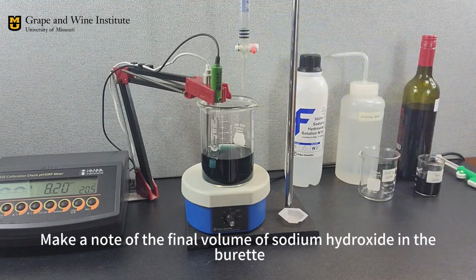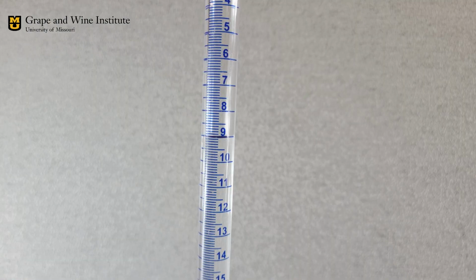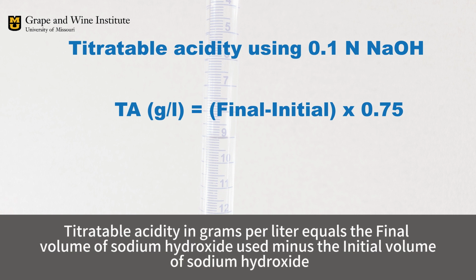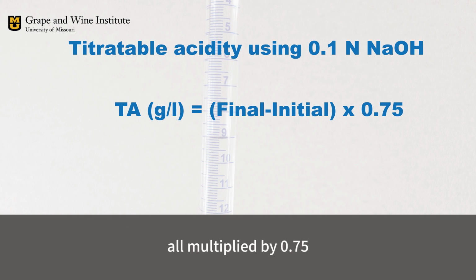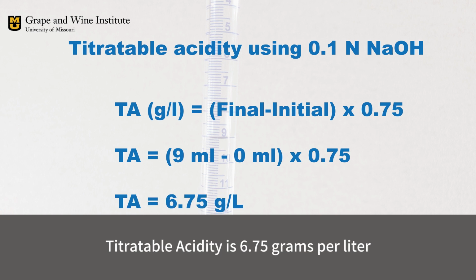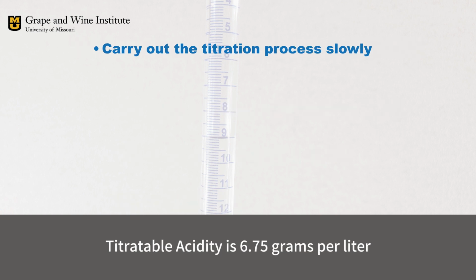Make a note of the final volume of sodium hydroxide in the burette. The final volume is 9 milliliters. Titratable acidity is calculated using the following formula. Titratable acidity in grams per liter equals the final volume of sodium hydroxide used minus the initial volume of sodium hydroxide, all multiplied by 0.75. In this demo, titratable acidity is 6.75 grams per liter.